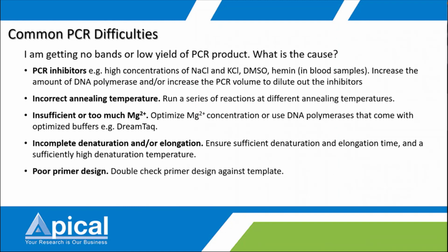But the easiest is to use DreamTaq, because with its PCR buffer you need less optimization. Also, you can optimize the PCR protocol to ensure sufficient denaturation and elongation time.